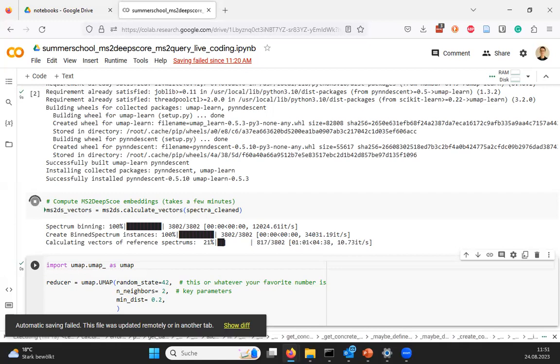Yes. Oh, yeah, sure. That's not good. What do you do? Everyone's trying his best. Is there any questions on what we're actually doing here, maybe?